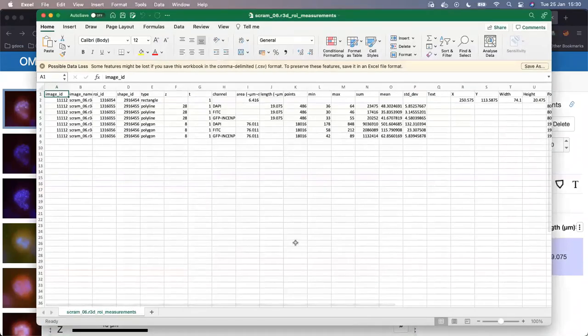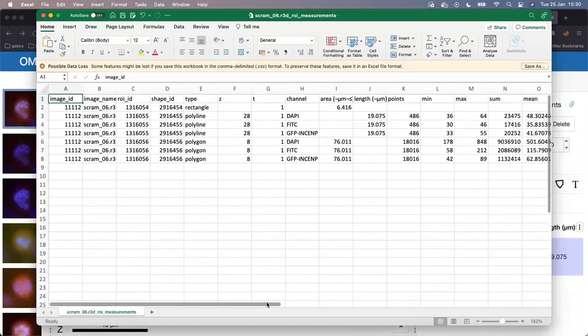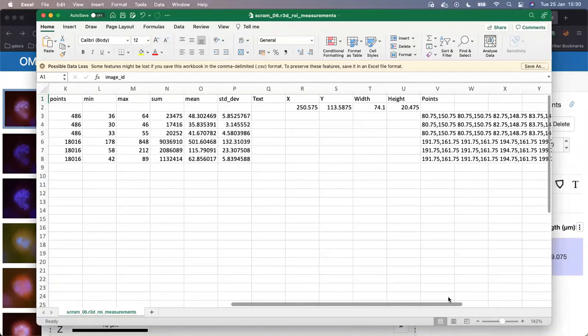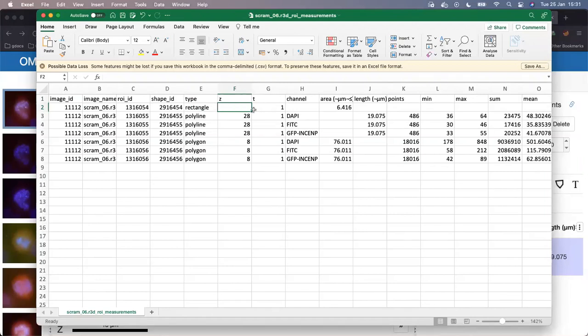And here it comes locally on my Mac, downloaded freshly from my OMERO.iViewer, the rudimentary image analysis on those ROIs. I can see that the Z is not filled in for the rectangle because I disassociated it. I have just one T-plane.